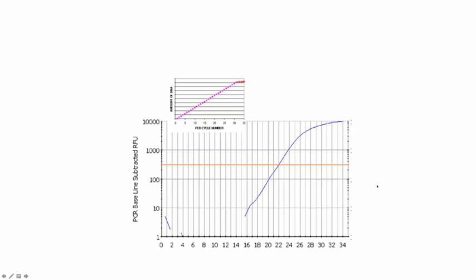amplification. So if we were to look at this on a theoretical basis, we'd say every cycle the amount of DNA is doubling until you run out of either primers, or your enzyme goes bad from being raised to a high temperature, or something causes the reaction to stop. You run out of nucleotides or something like that.